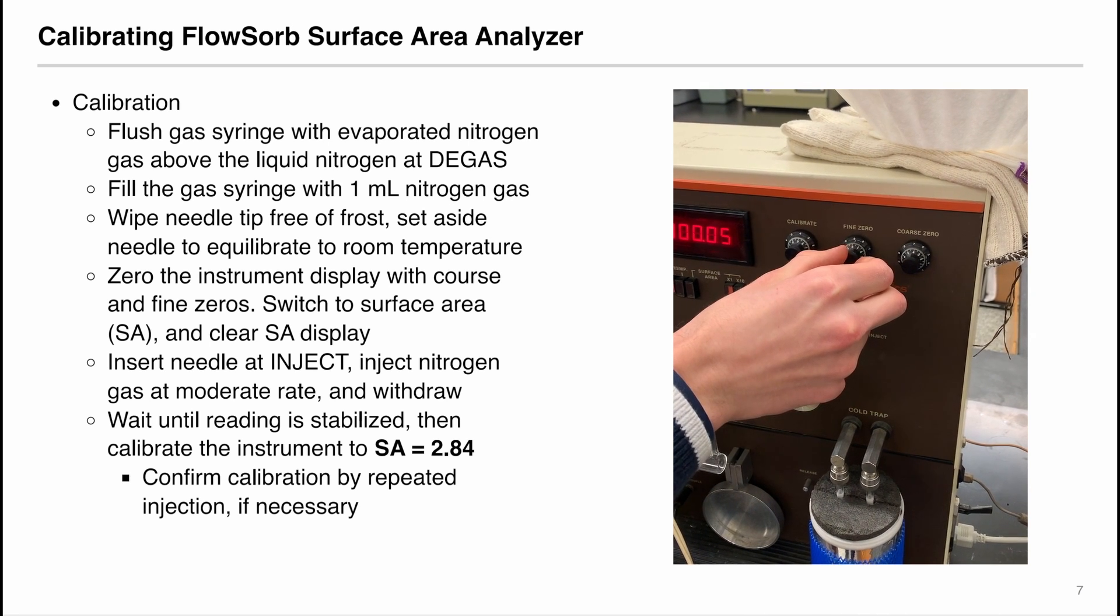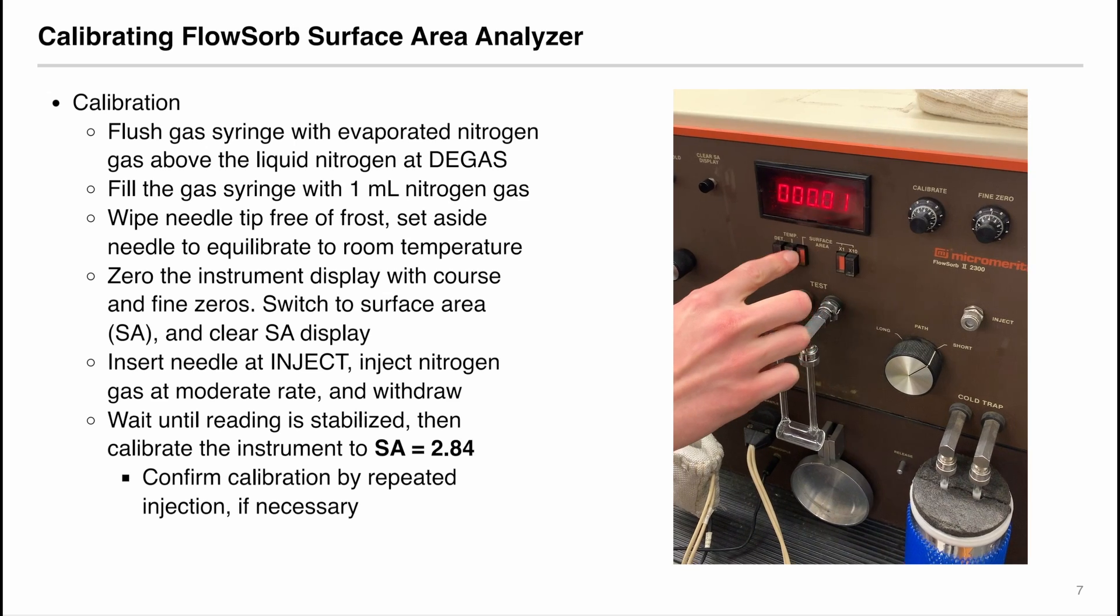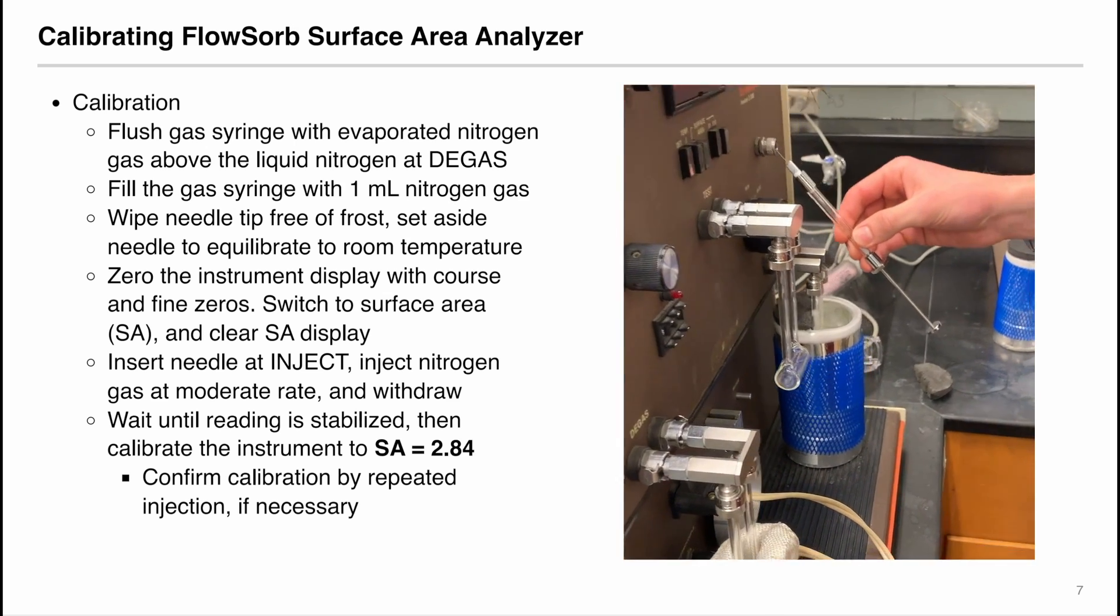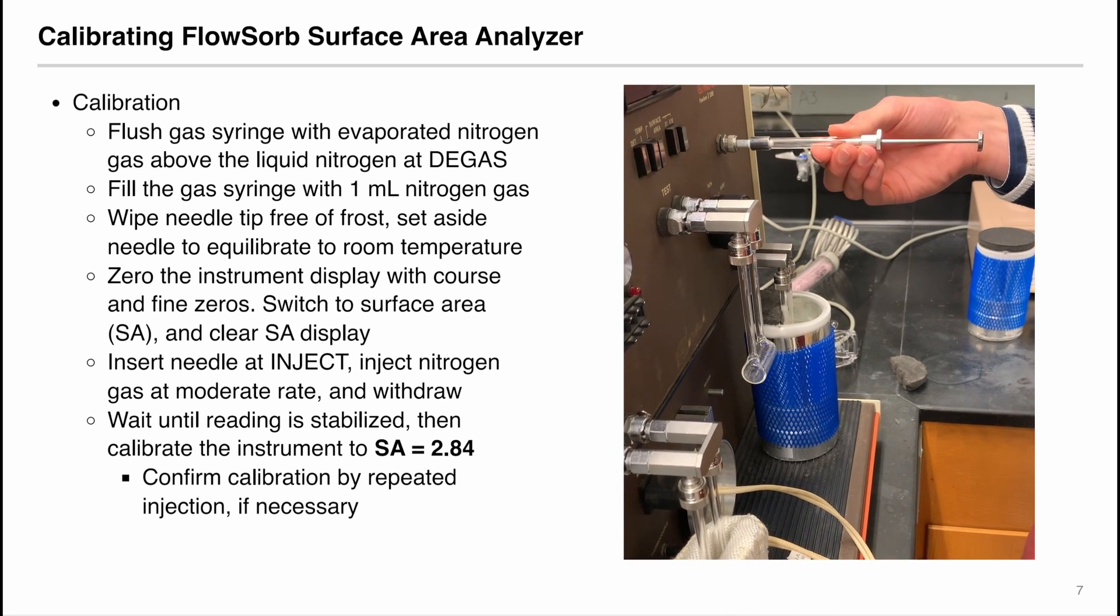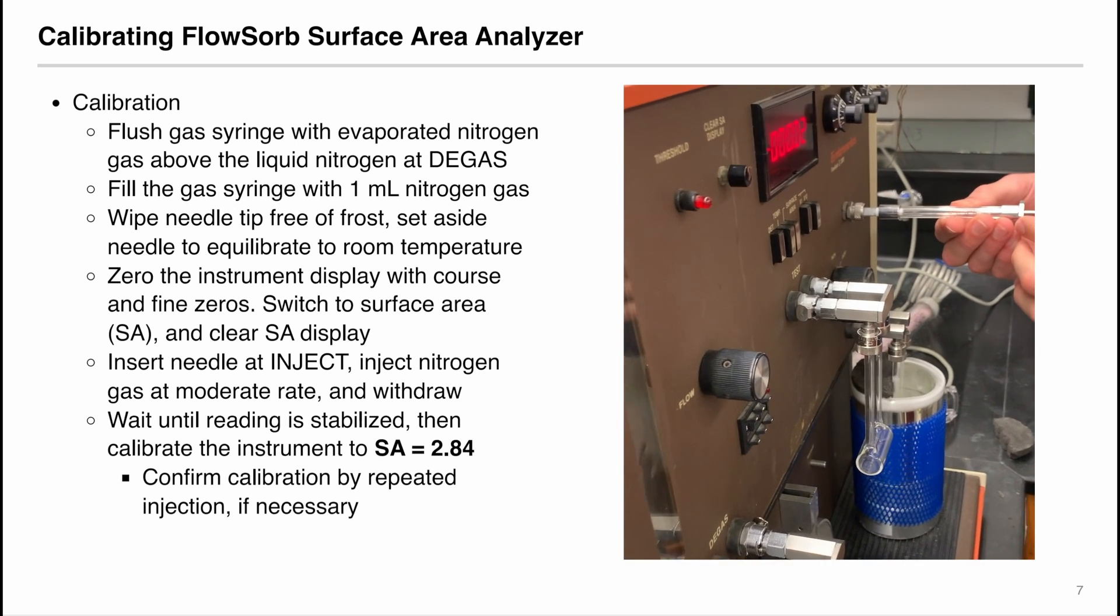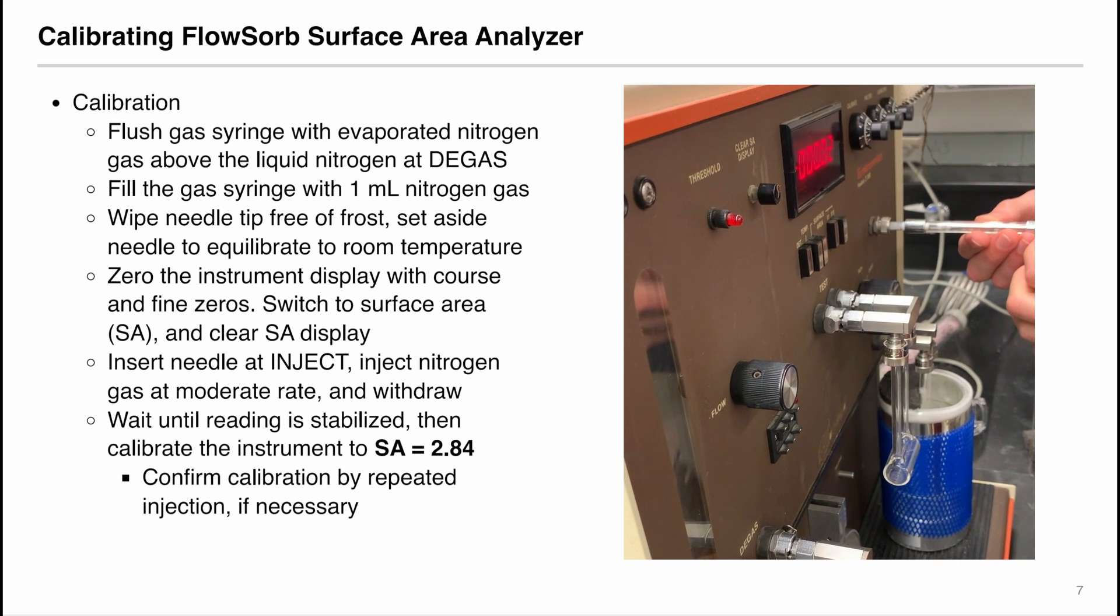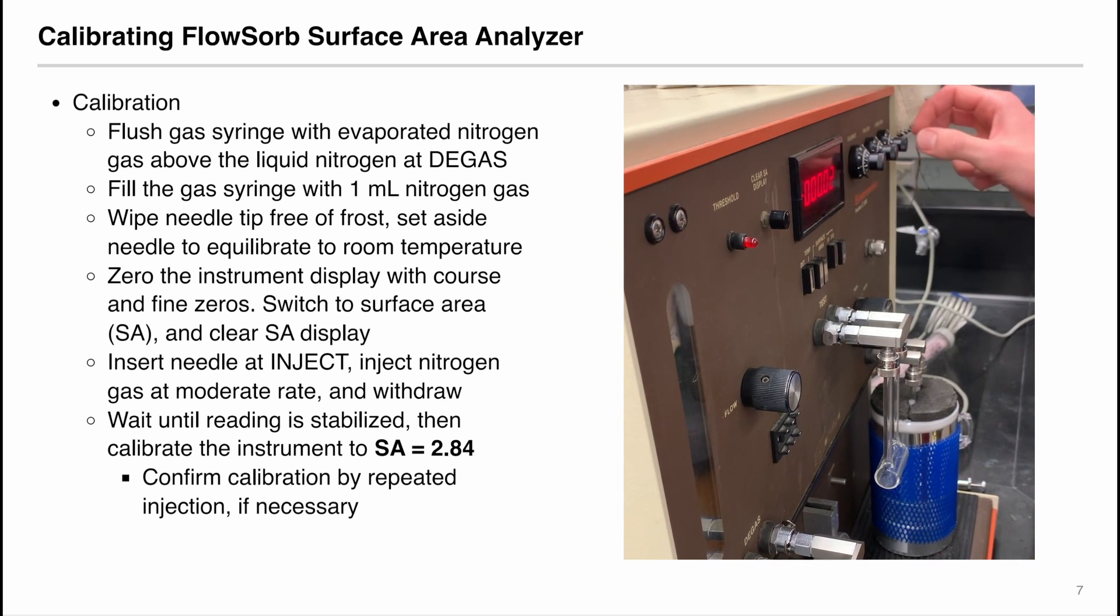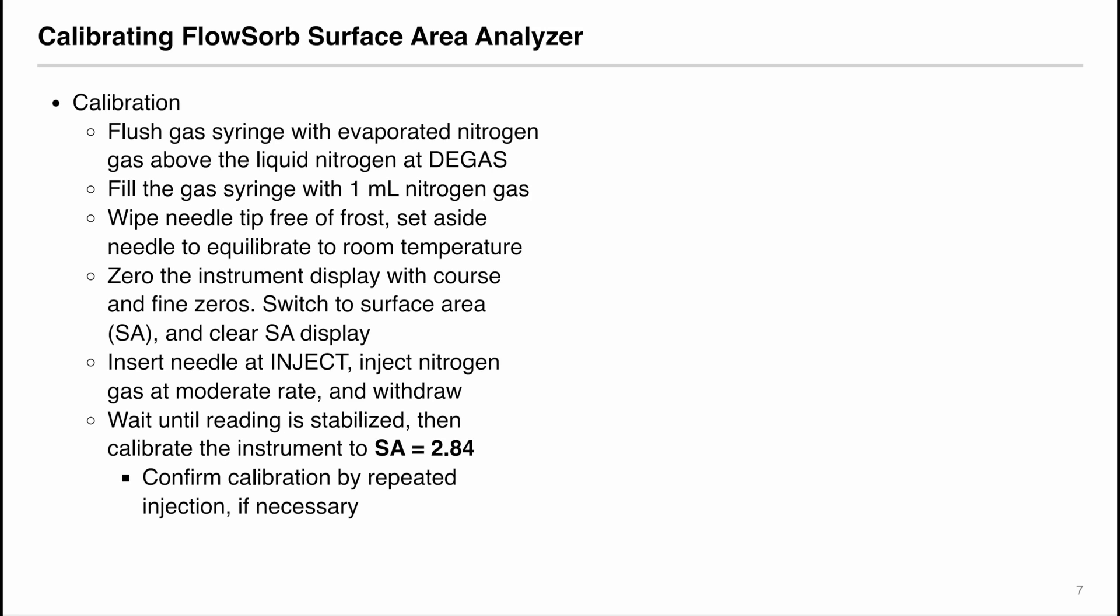Then zero the instrument display using the coarse and fine zeros. Then switch to the surface area or SA mode and clear SA display. Now insert the needle at the inject position and inject the nitrogen gas at a moderate rate. And withdraw the gas syringe. Wait until the reading is stabilized. Then calibrate the instrument so that the SA is equal to 2.84 by adjusting the coarse and fine zeros. You can confirm the calibration by repeated injection of gas nitrogen if you deem necessary.